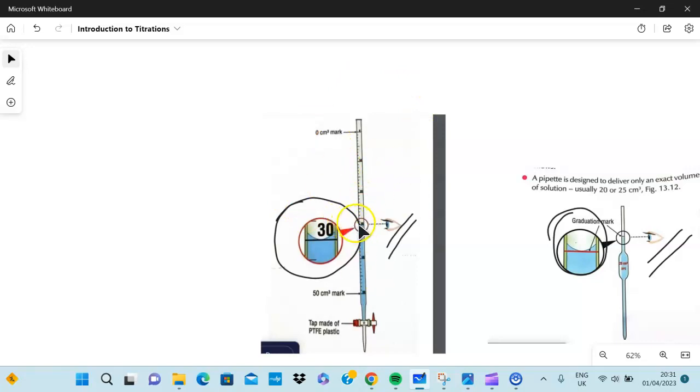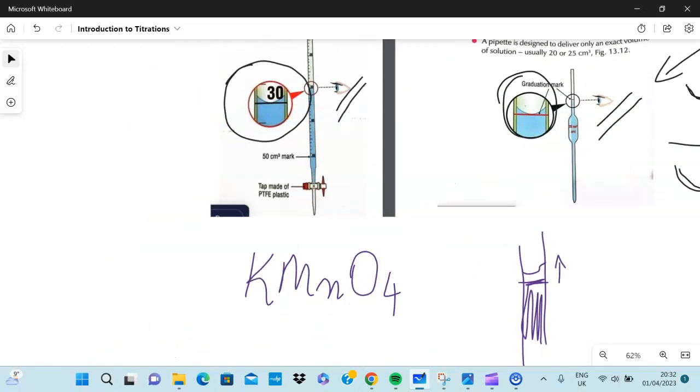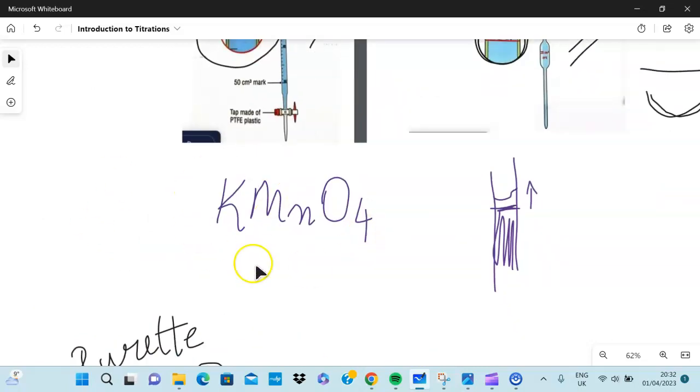That's the same for all instruments and apparatus that we use. You can see the burette here, you put it there, and you have to say eye level, eye level all the time. You say until the meniscus reaches the bottom of the graduation line at eye level. The only exception to this rule is if you're using highly pigmented liquids or solutions like potassium permanganate, KMnO4. In that case you read the top of the meniscus from the graduation mark because it's so pigmented that you can't see.